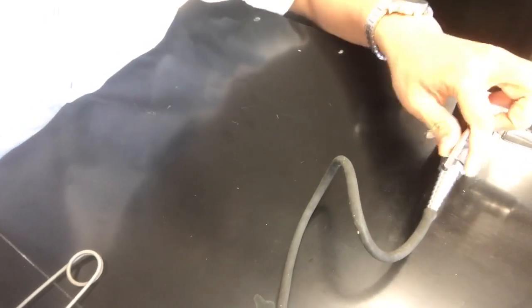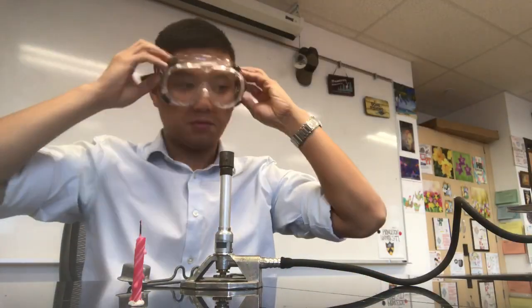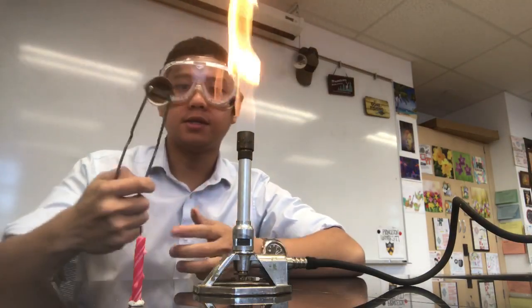Okay, a couple of things. These gas turrets, when it's in this position, this is off. This is on, this is off. This is on, and this is off. And so we're going to put on our goggles, safety first, turn the gas on, and we're going to light it with our magnesium fire starter, okay?